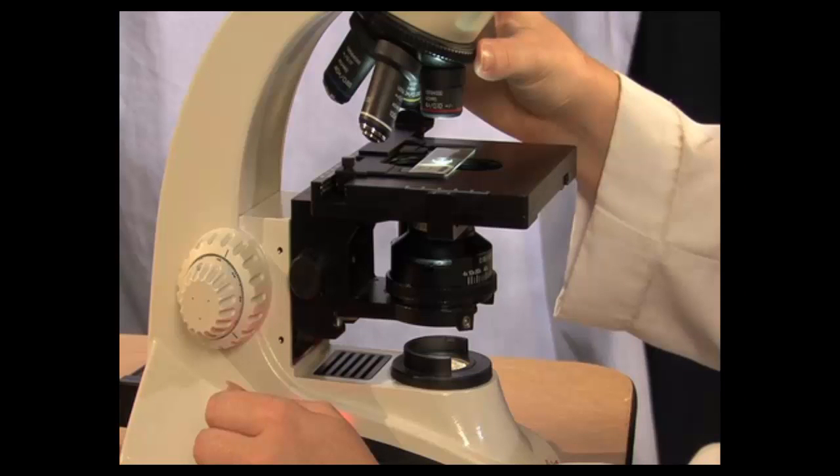But with the right scientific tools, such as a light microscope, we have the magnifying power to view a sample of the cells in this water.